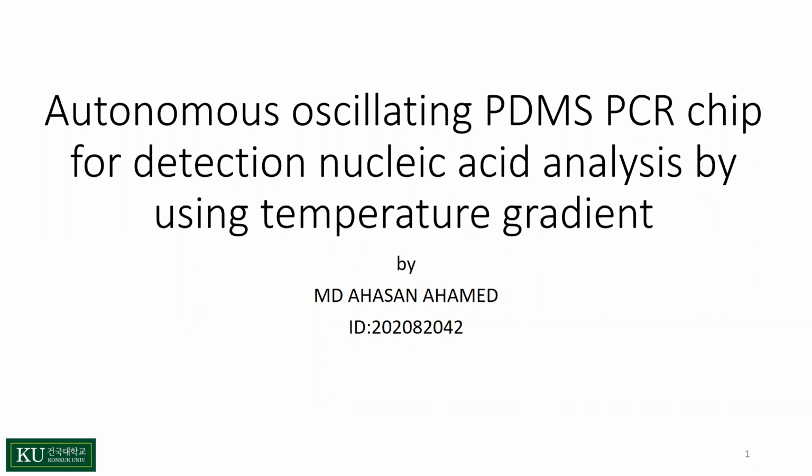So I am going to present a question and answer session about my previous presentation, in which I mentioned an autonomous oscillating PDMS PCR chip for nucleic acid detection and analysis by using temperature gradient.